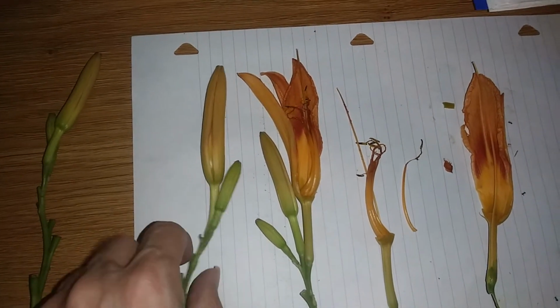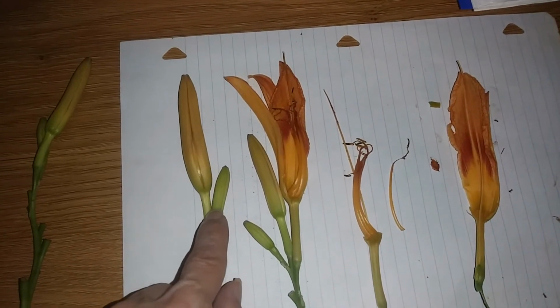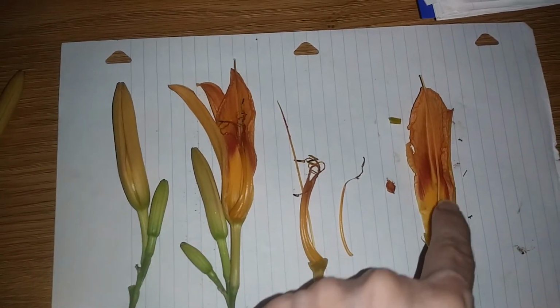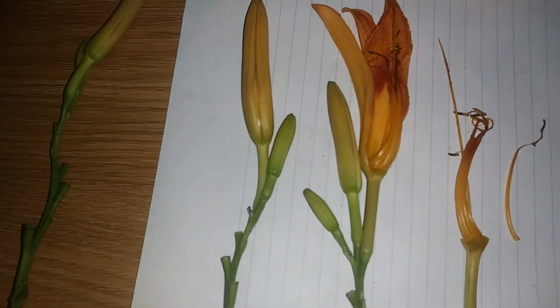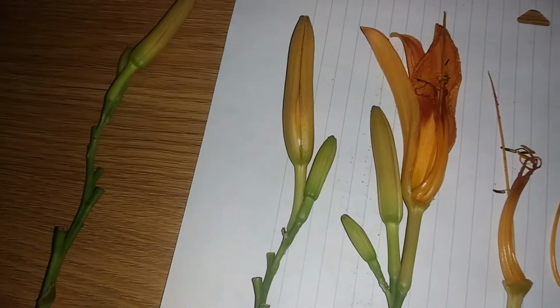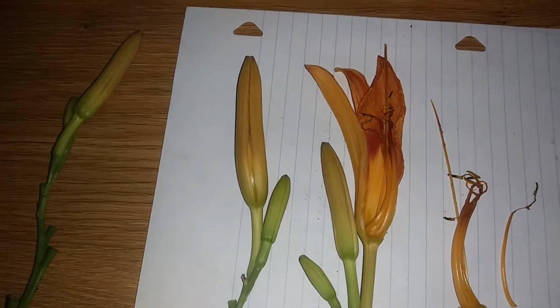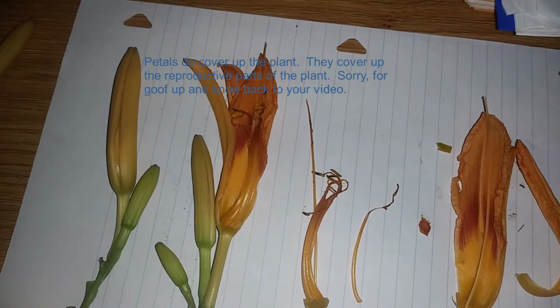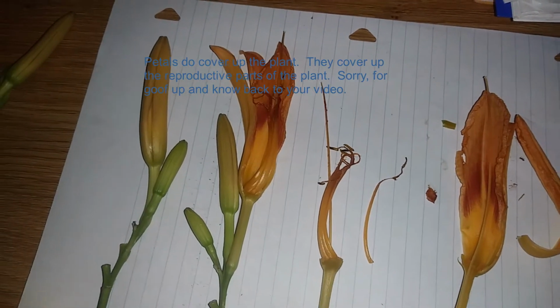So all flowers start off as buds, and these are the sepals, the green part that covers up the maturing flower. Okay? The petals are the part of the flower that actually covers up the plants. And this is a petal. At night, they may close up during bad weather. They also help to attract pollinators in. And they, again, protect the reproductive parts.